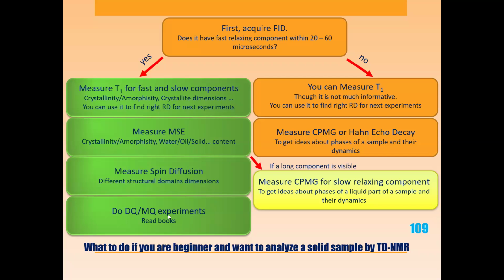And of course, you can implement double quantum, multiple quantum experiments to characterize somehow the correlation function of molecular motions.